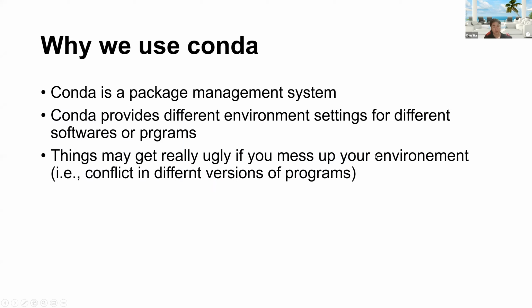The other thing is it also avoids conflicts between different programs. Sometimes programs require different versions of a program, for example, the Python versioning issue that we just had before. So you can set up a different environment with a different Python version for that case, and we won't have any conflict with the other programs.